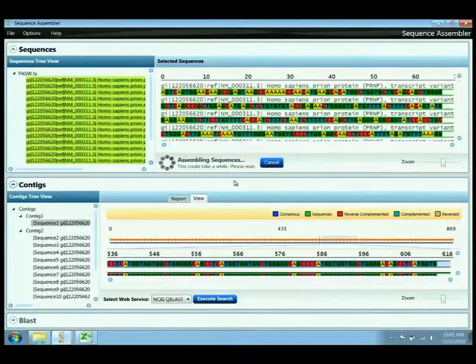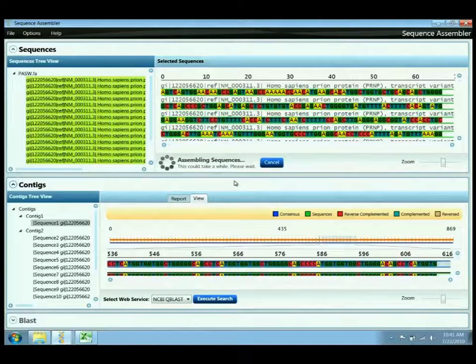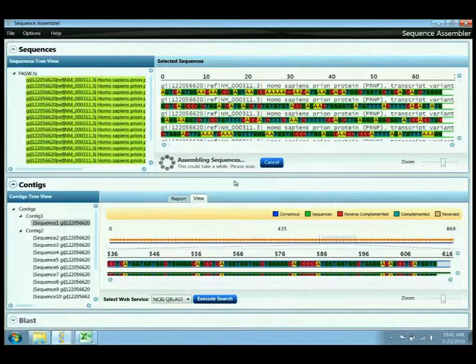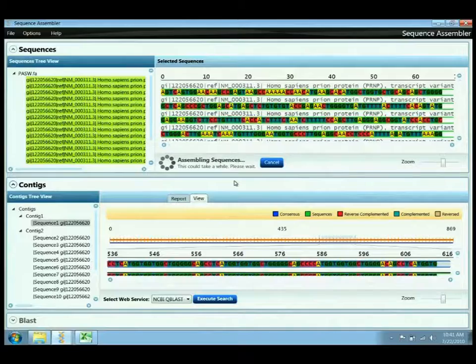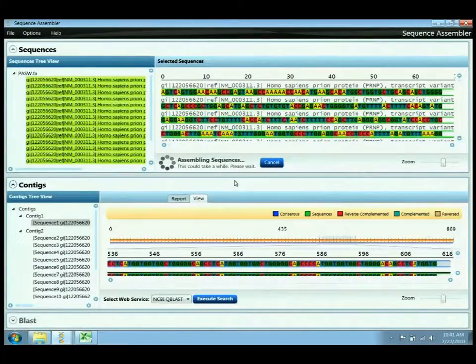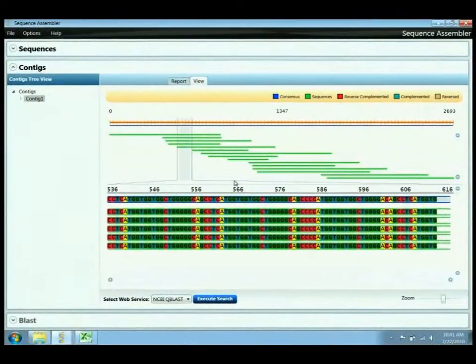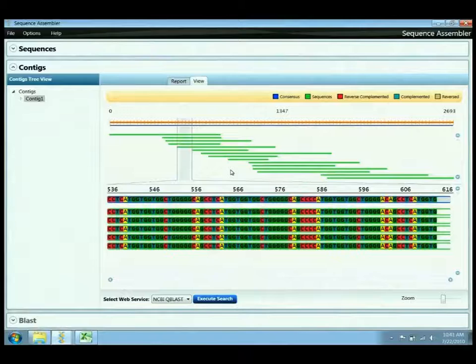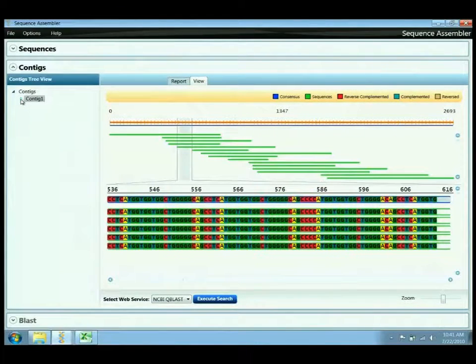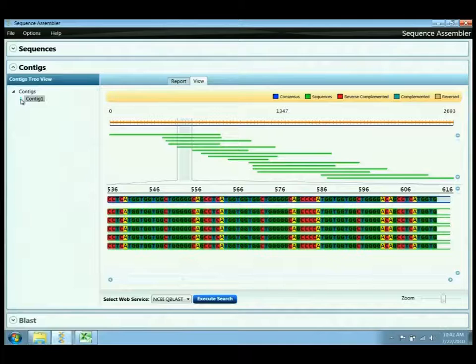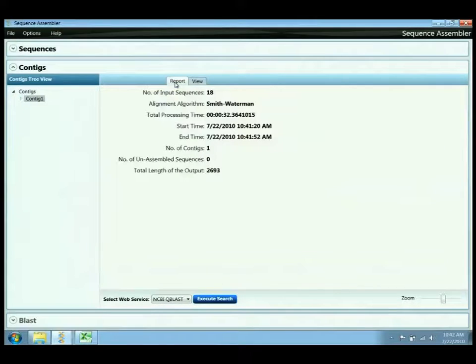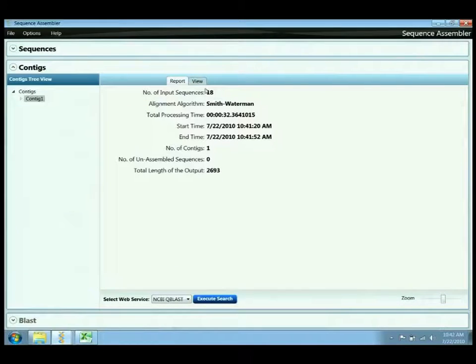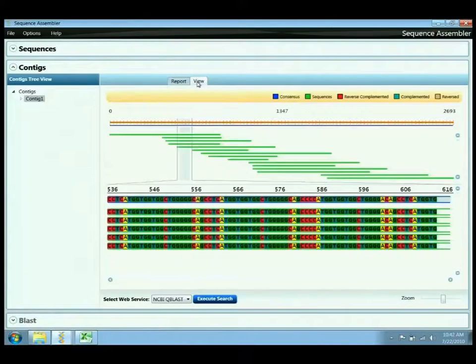Padina, the parallel de novo assembler, is optimized to be very quick and for use in very large number of sequences and very large sequences. So in this case, you can see we've resulted in a single contig, but it's taken 32 seconds to perform. So the trade-off here is that we've got a more complete result containing sequence 1 and 2 through 18, but that it took much longer to obtain these results.